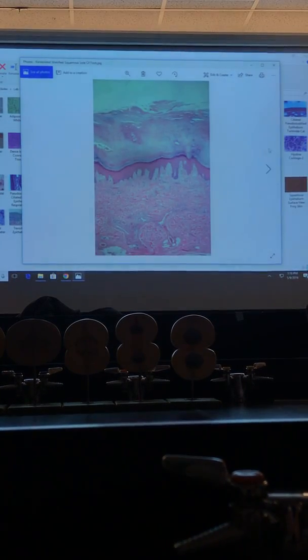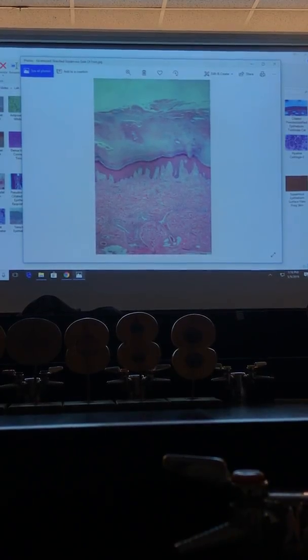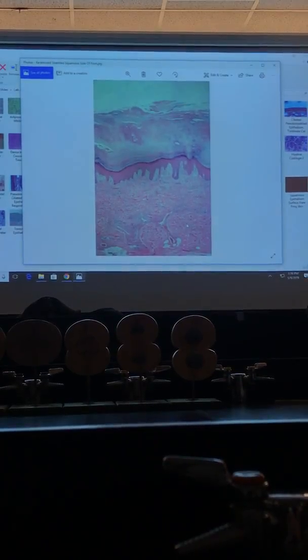We'll do this again in a bit. This is actually thick skin. So this is all epidermis we'll learn today. But I would go deep dermis. So deep here, this is DICT. Okay? So that's slide 10, 11.